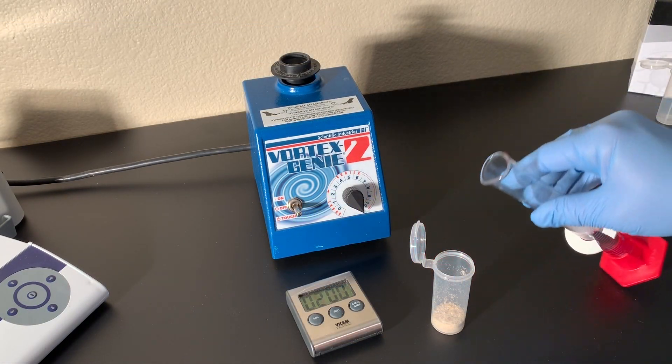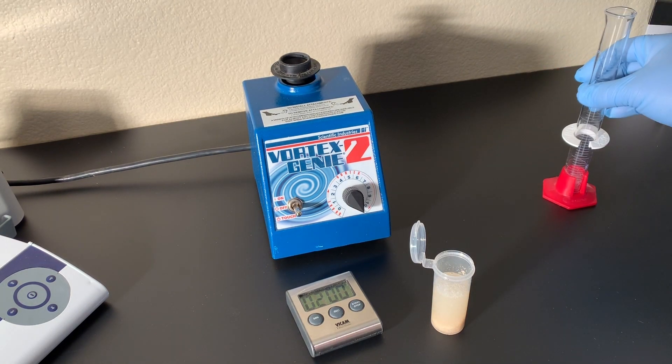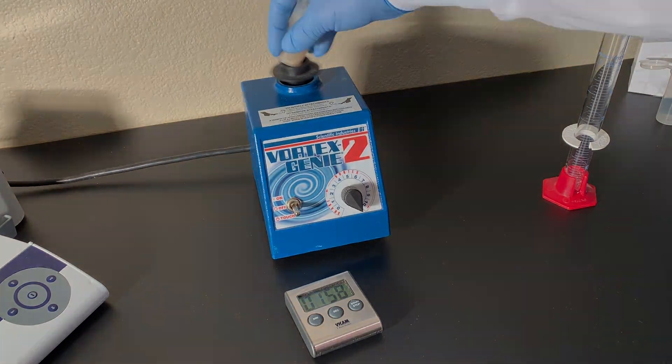Weigh 5 grams of finely ground sample into an extraction tube, then add 25 milliliters of aqua pre-mix. Extract the sample by vortexing at high speed for 2 minutes.